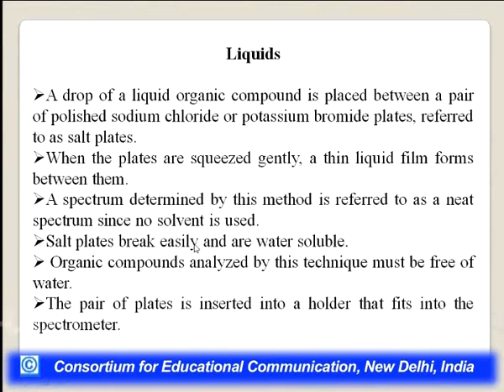Salt plates break easily and are water soluble. Organic compounds analyzed by this technique must be free of water, otherwise it will give its own peak. The pair of plates is inserted into a holder that fits into the spectrometer.